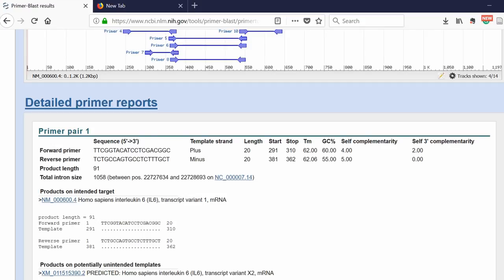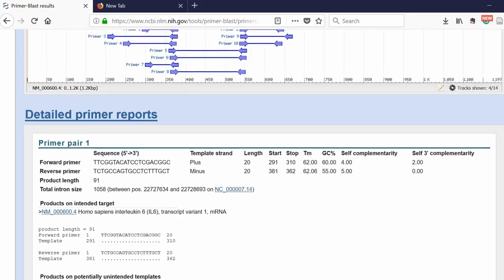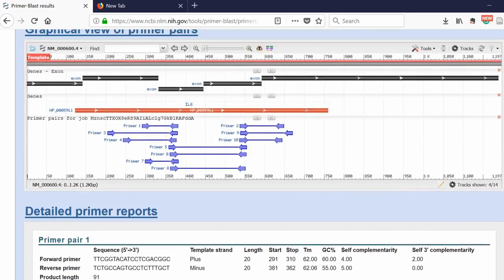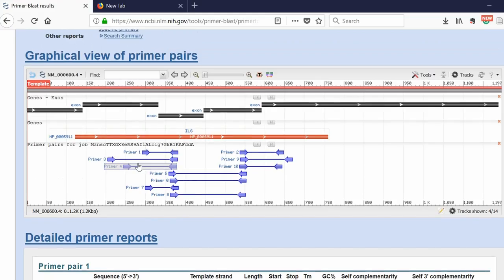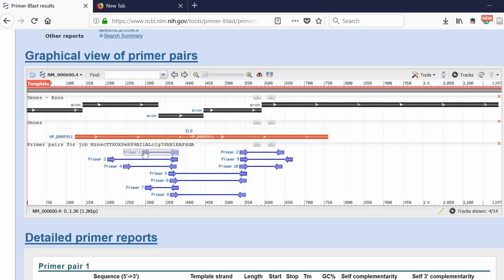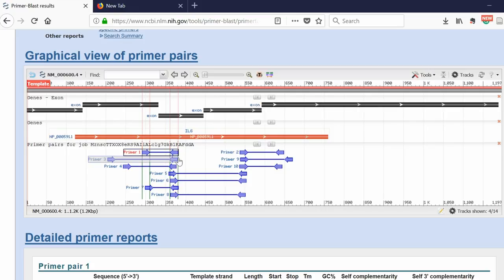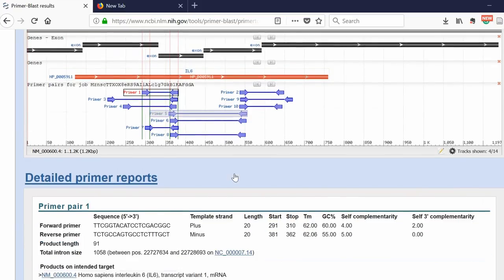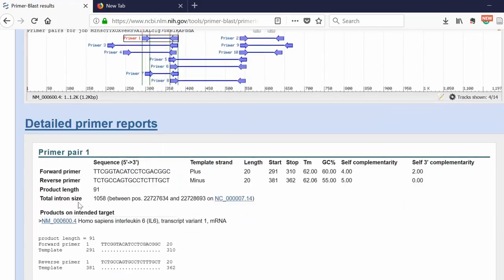We specified to do an intron inclusion, so Primer Pair 1, if I scroll up, you can see the forward primer is actually binding to exon 2 here, and the reverse primer is binding to exon 3. Obviously, in the middle, there'll be an intron here. It's specifying that the intron size is 1,058 base pairs.